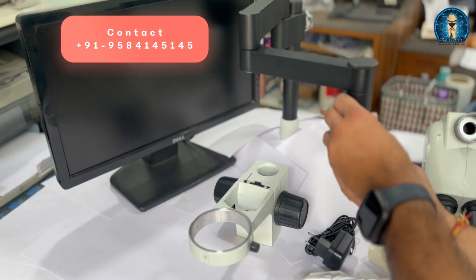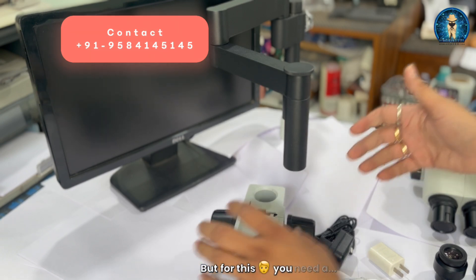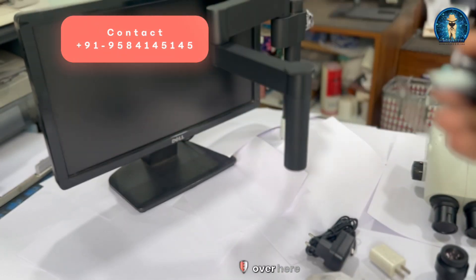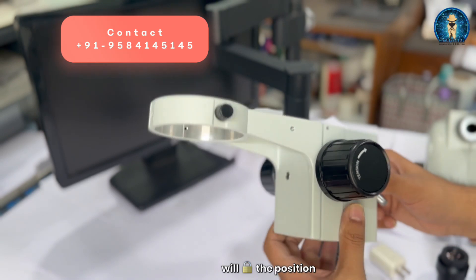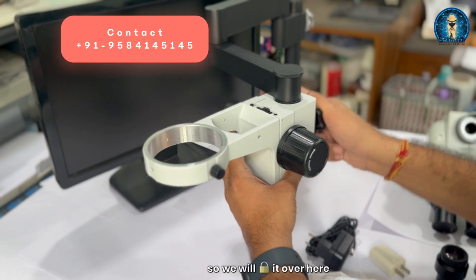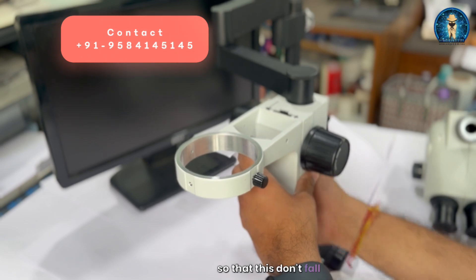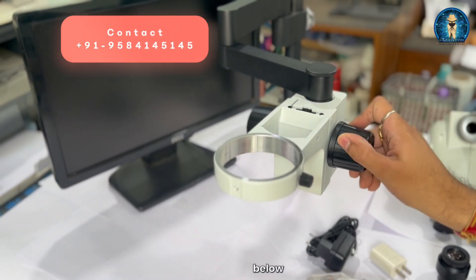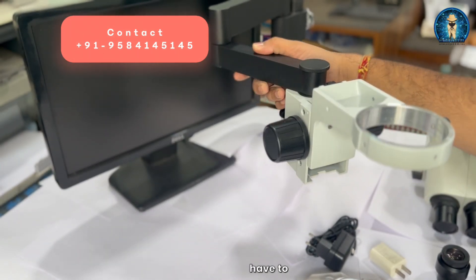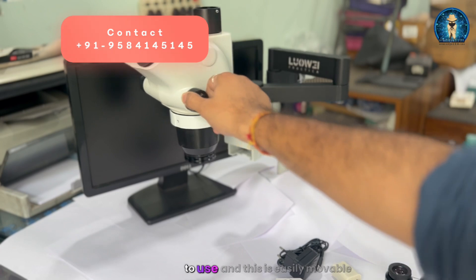Now we have to open the safety knob and place the head over here. For this head you need a holder so it can lock — we have the knob that will go inside and lock the position. We will lock it here and then put the safety locks below so the head doesn't fall. We have placed the safety knob below and our stand is now ready to use.